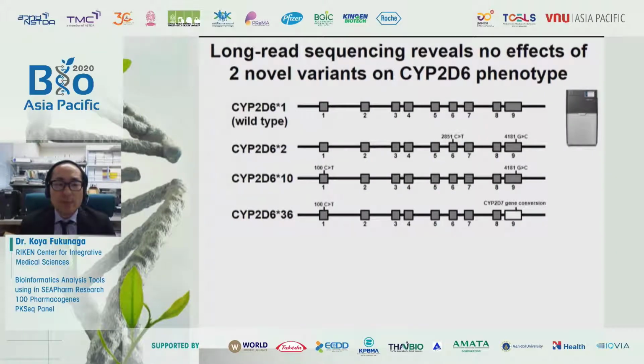Here, a problem has occurred. To detect the haplotype of CYP2D6, the read length of a short-read sequencer is not enough to determine the haplotypes between variations. Therefore, I used a long-read sequencer to detect the haplotypes of CYP2D6. This time, I used the Sequel of the PacBio company.